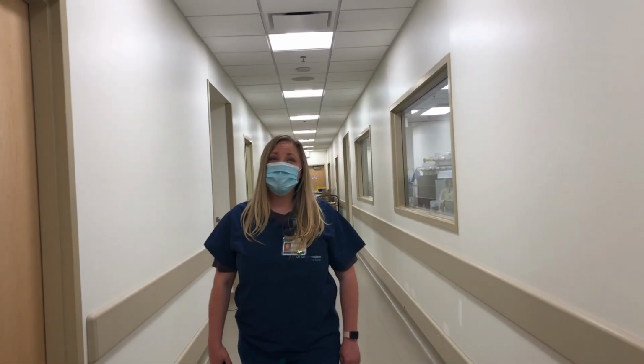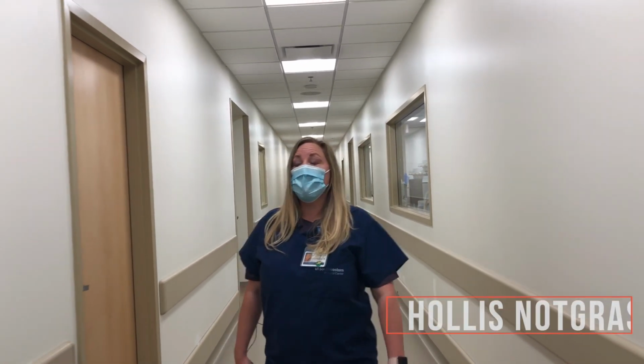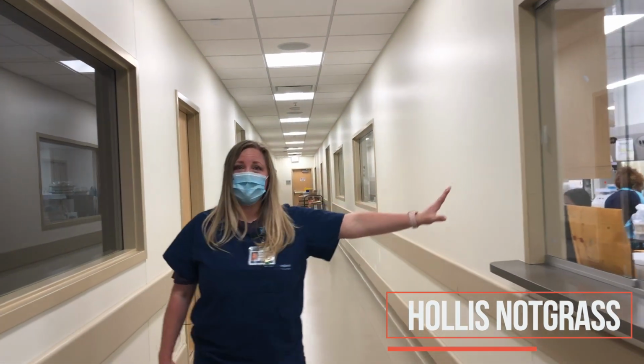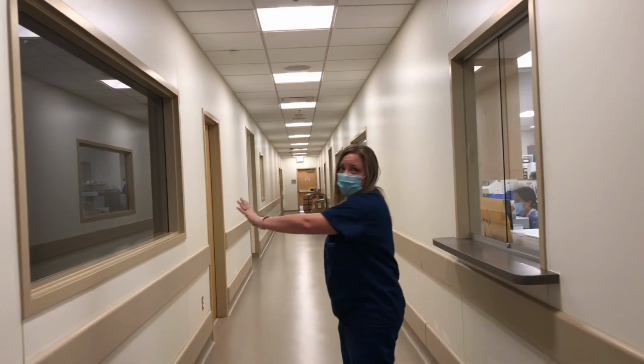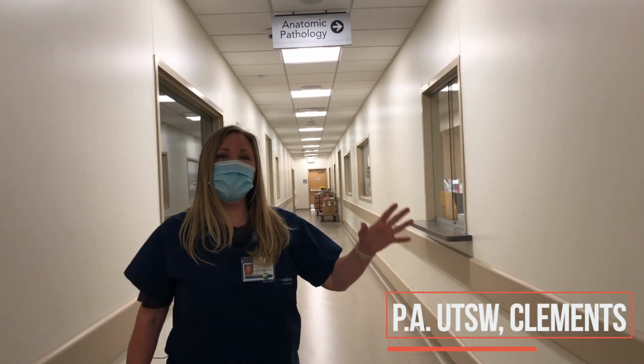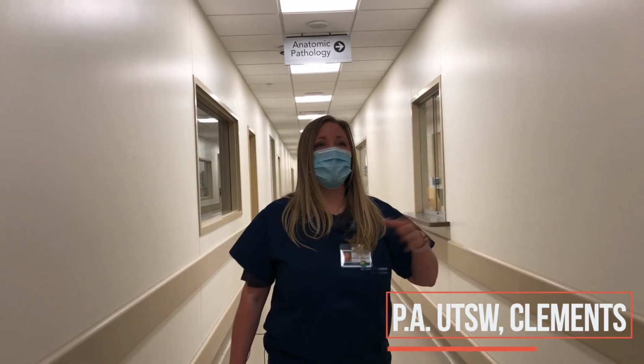Hi, and welcome to a tour of our anatomic tissue lab. All of our anatomic pathology is done on the 4th floor of our hospital here on one side. We have all of our clinical pathology on the other, which we'll go through a little bit later. But anatomic pathology is where all of our tissue specimens that come from the OR will come through.